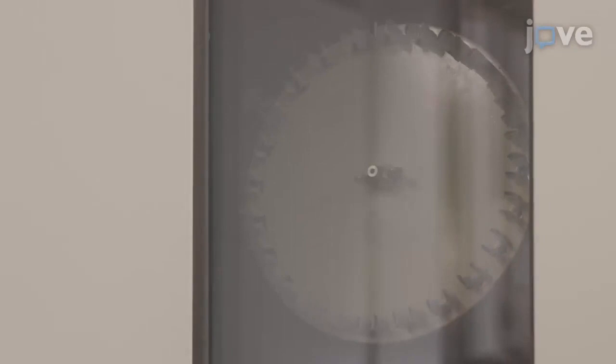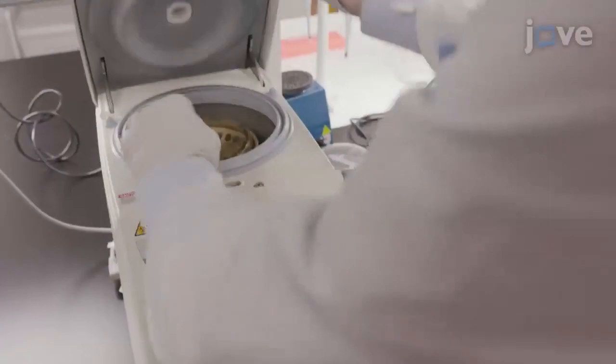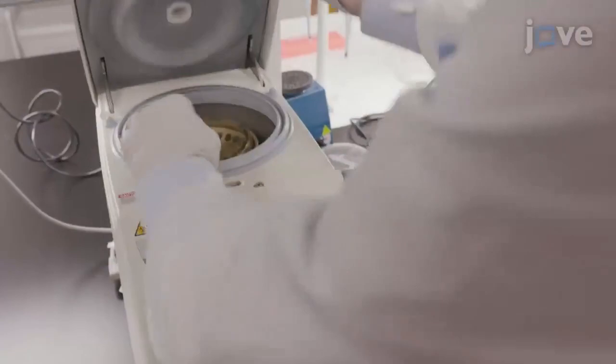Mix well by inverting the tube several times. Then rotate the sample for 30 minutes at 4 degrees Celsius. Centrifuge the sample at 13,000 times gravity for 4 degrees Celsius.